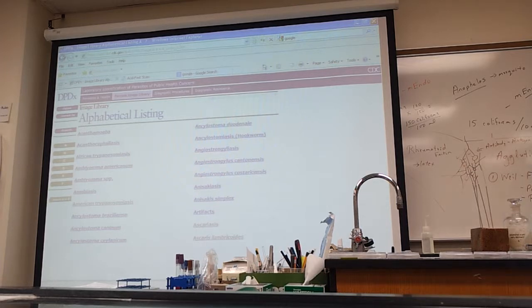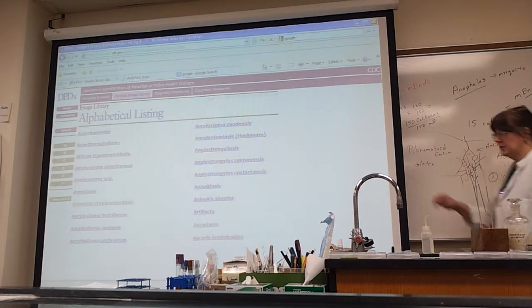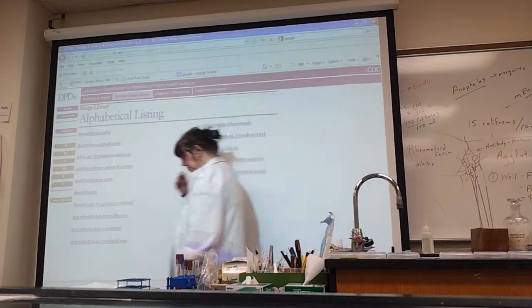I'm going to move to your lab final review sheet. I'm going to move over to parasitic protozoans. It's your third sheet, about a quarter of the way from the bottom. I'm going to start showing you some of these.